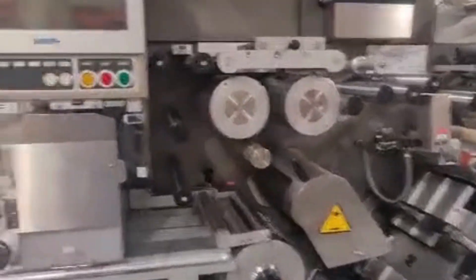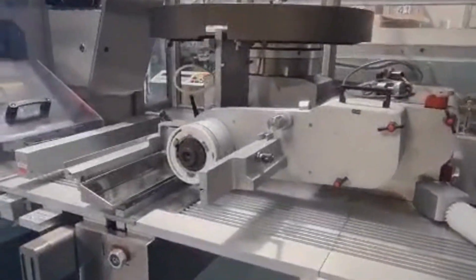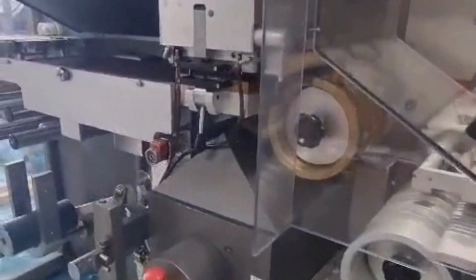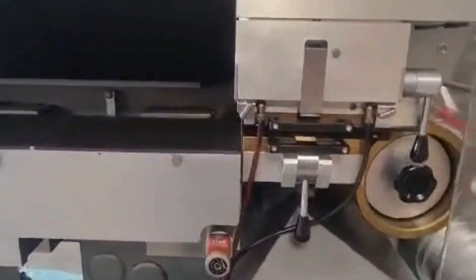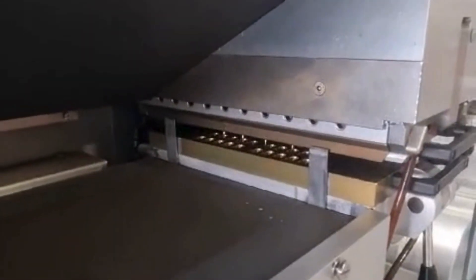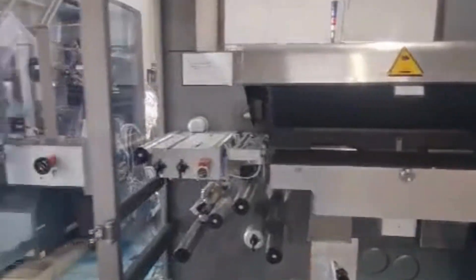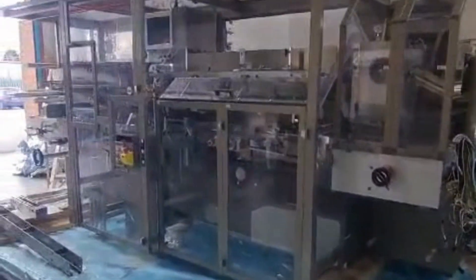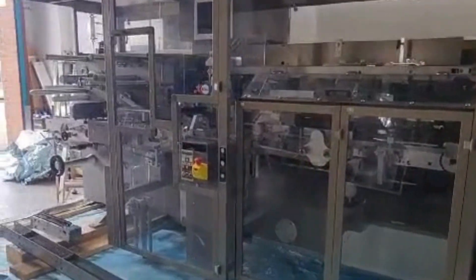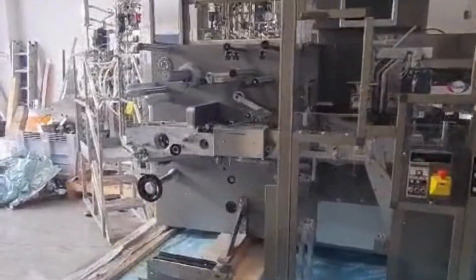This is the main blister packing machine and there are some format parts included. This is the cartoning machine — it has been separated for shipping and collection purposes, but the cartoner is integrated with the main blister packer.